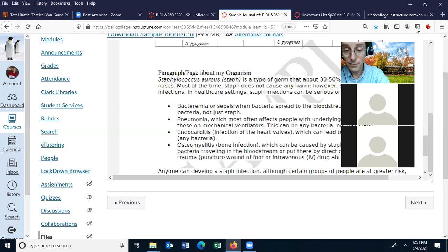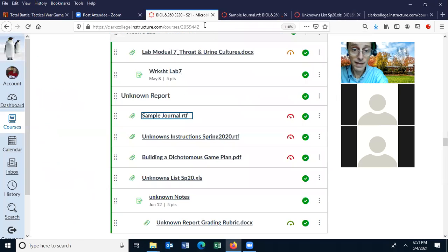So I'm going to do the first 3 tests for you. And then you're going to look at your results and observations, make your conclusions, and then determine which tests you want to run next. Okay? And then you ask for it, and you can find how long that will take.